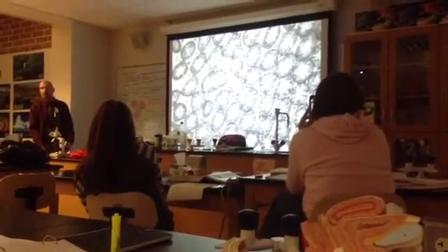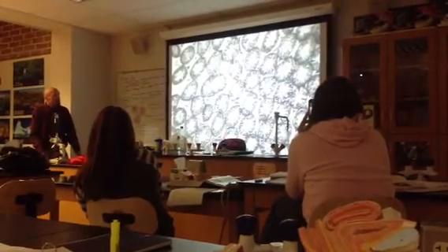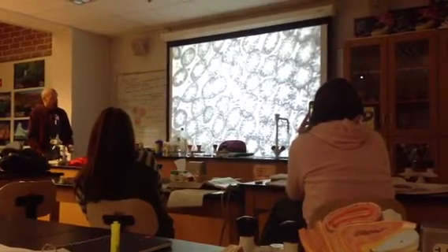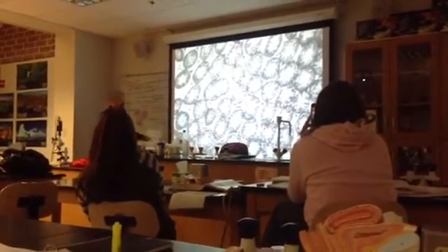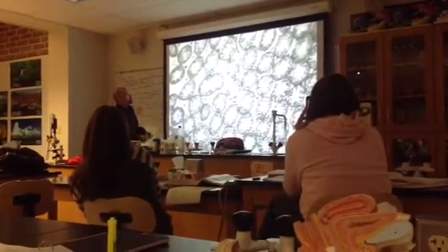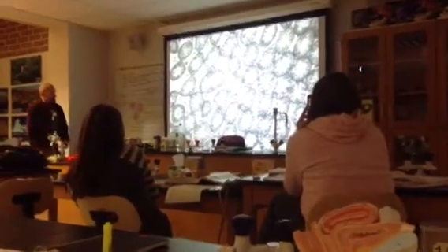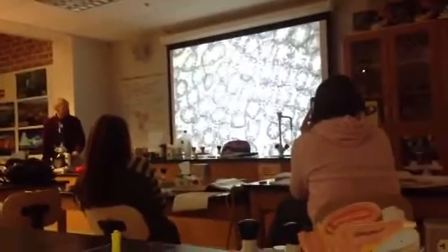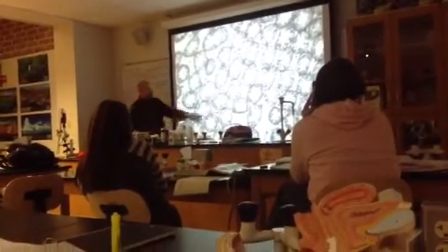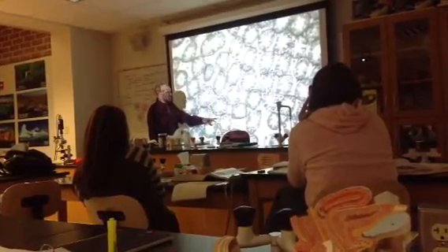And that's where sperm are made, in seminiferous tubules. Really, I'm going to blow it up to a higher level, but each one of these is an individual seminiferous tubule. And then in between seminiferous tubules, you have, let me see, well here we go, raise it a little bit. Not the best slide for these, but you see how in some of these you have very distinct cells in between the seminiferous tubules.